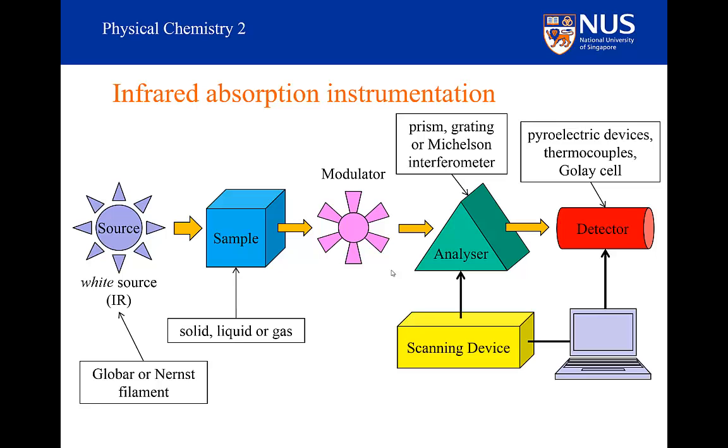If I had a pair of infrared goggles on, I would see the amount of infrared radiation everyone is emitting. But if you held a piece of glass in front of yourself, I wouldn't be able to see you at all. You'd be invisible to me. Therefore, we cannot use glass optics. We have to use something that is transparent to infrared radiation.